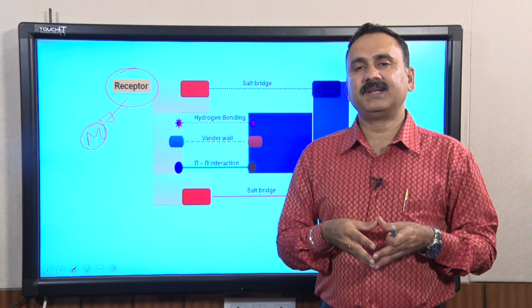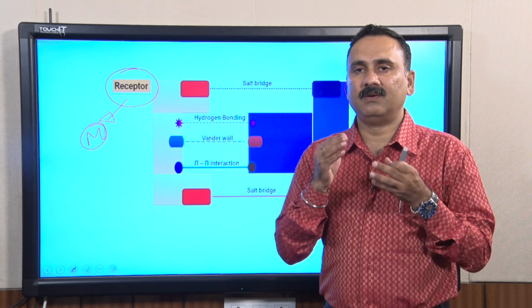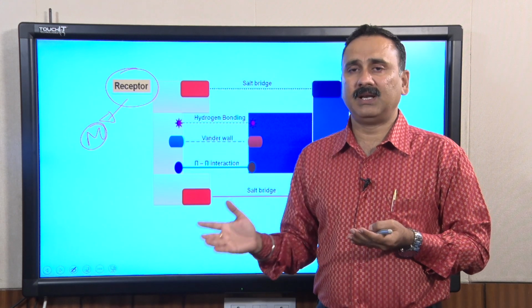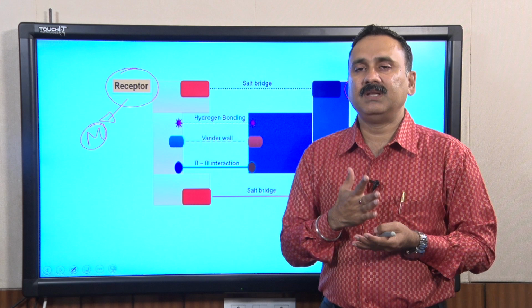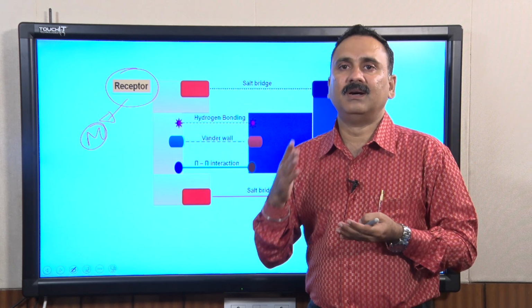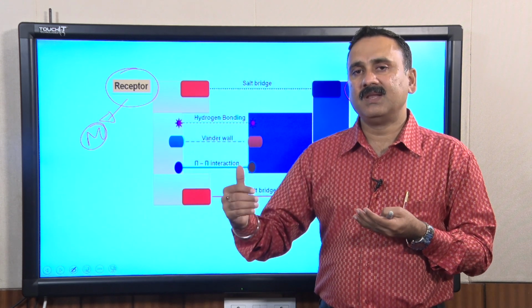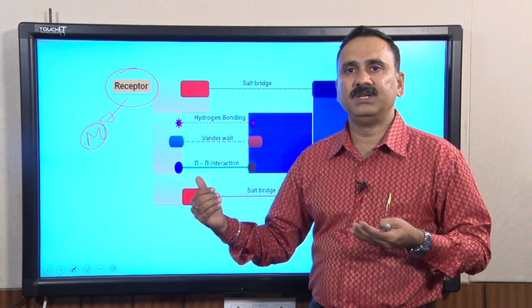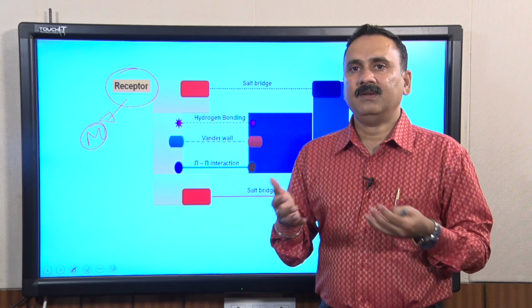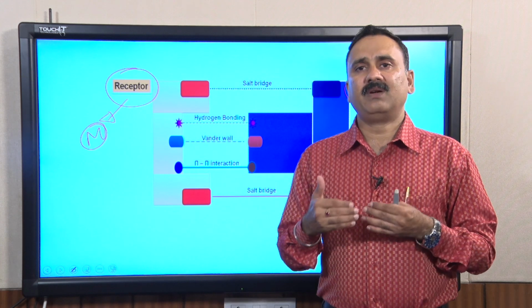and then you are going to perform the chromatography techniques. So, if you would like to perform affinity chromatography, the first step is that you have to generate the receptors or the ligands. Then the second step is to couple these receptors to the matrix. The third step is to produce a protein which contains the ligand attached to it, and the fourth is to perform the chromatography and purify the protein. So, with this we would like to conclude our lecture here.